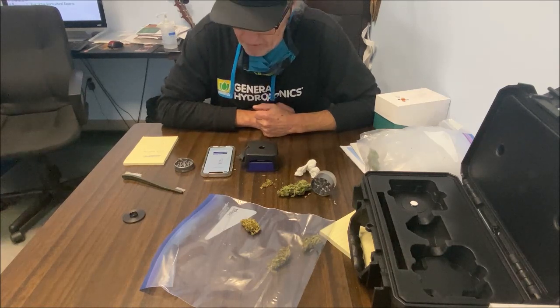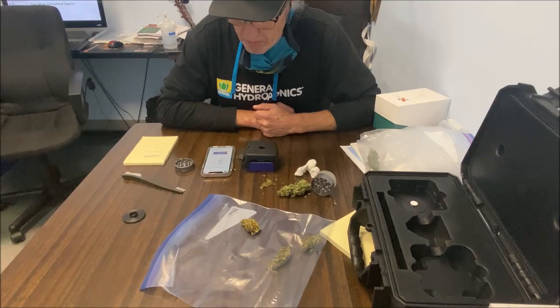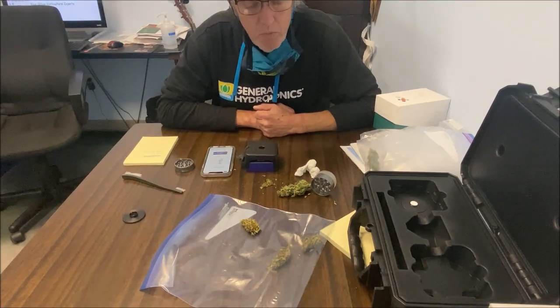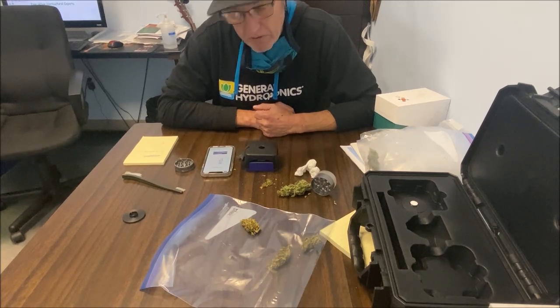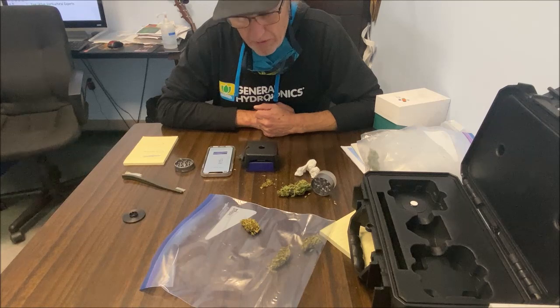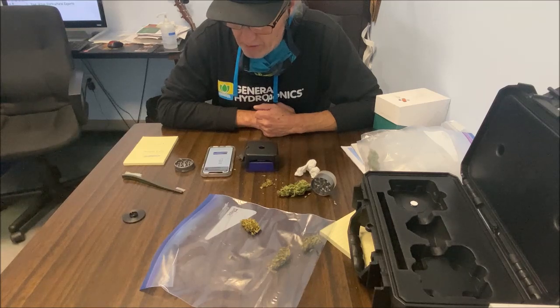Okay, well, there you go. We've got 18% THC on the Clean Chemo. That's a good number. I had tested this earlier, but it was still quite wet, so the plant still had a lot of moisture in it. I got quite a bit lower reading. I think that curing is very important. This is giving me a moisture content too of 8.4%.